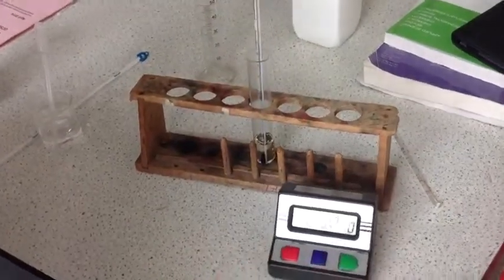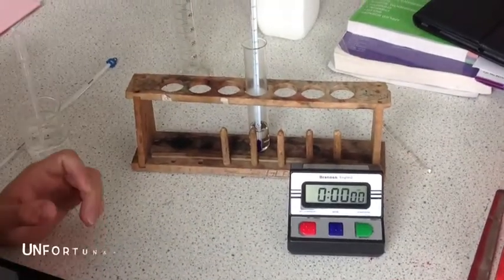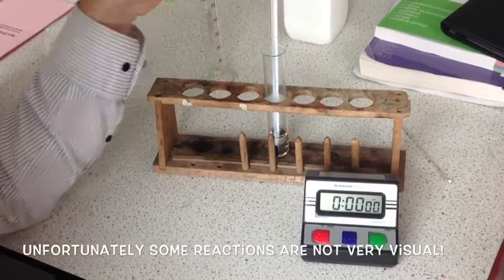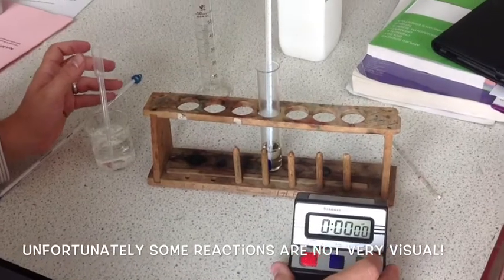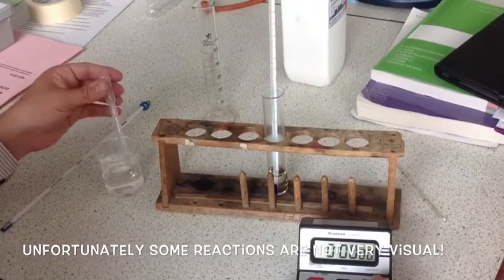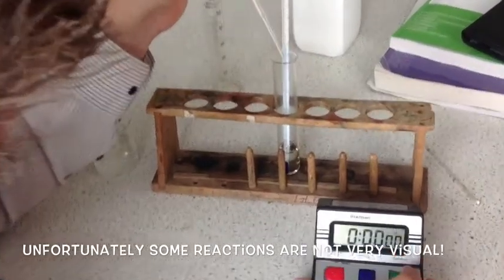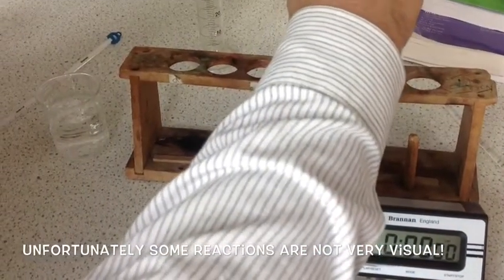Right, both the reactions that we've looked at so far are pretty good because they both produce gases, but a lot of reactions don't produce gases, and somehow you have to try and measure the rate of those reactions as well. This is very concentrated sulfuric acid, and when you add water to concentrated sulfuric acid, it gives out a lot of heat. Now if we measure the rate of temperature change, we can measure the rate of that reaction. Just to illustrate how much heat is given out in this reaction, I'm just going to put a drop of water in there.